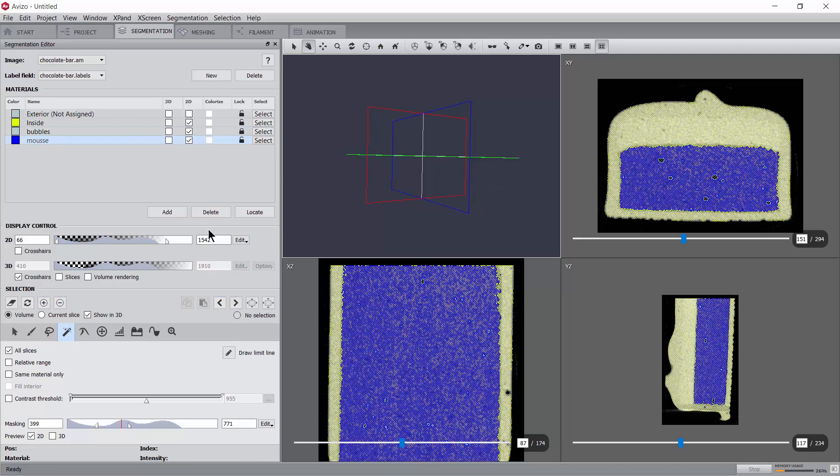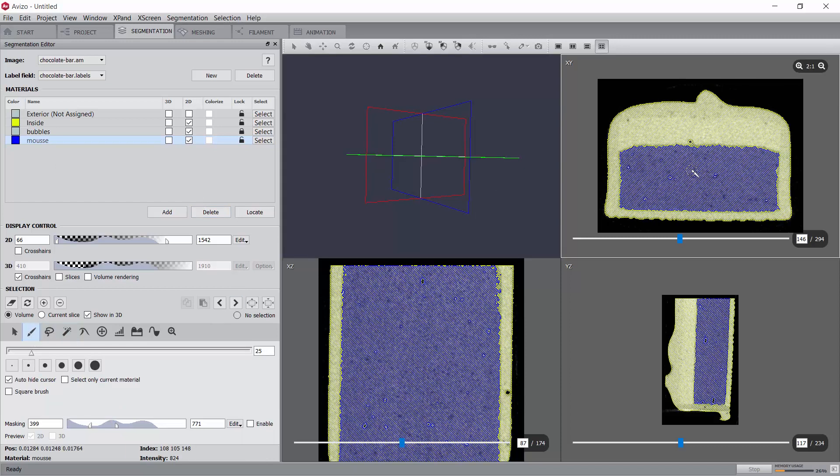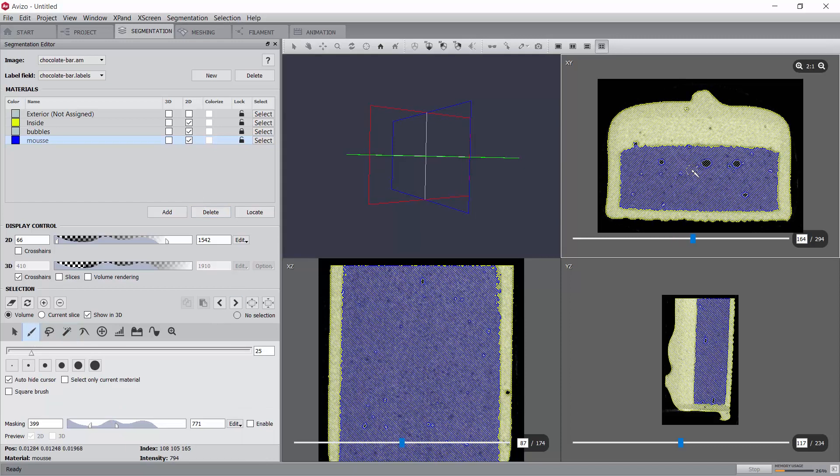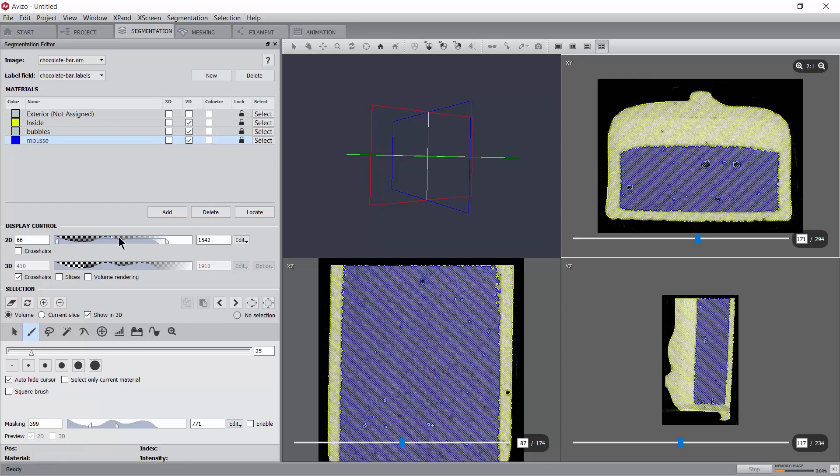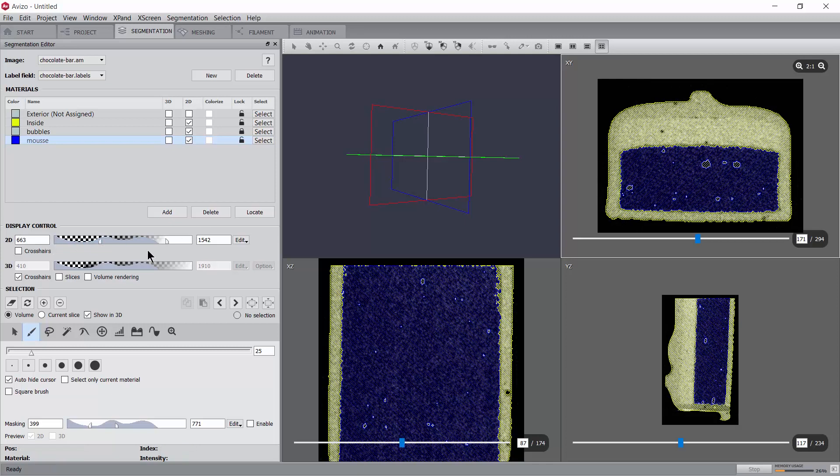In order to segment the caramel layer, since the difference of grey levels with the chocolate is very low and the noise is quite strong, we will rely on manual segmentation and use shape interpolation to accelerate this manual process.